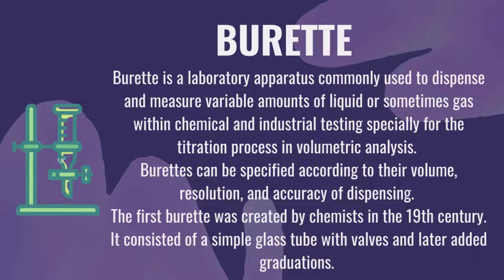You know, burettes can be specified according to their volume, resolution, and accuracy of dispensing. Smaller diameter tubes result in lower volume and increased resolution. Digital burettes can achieve better accuracy and are less dependent on the skill of the technician.